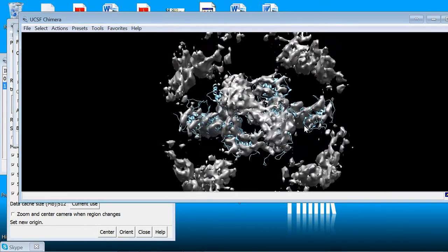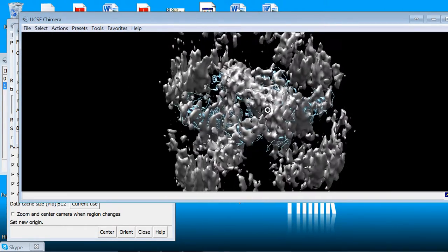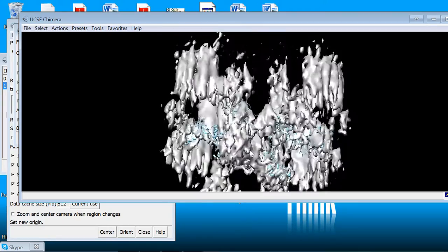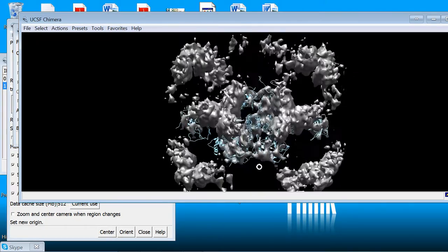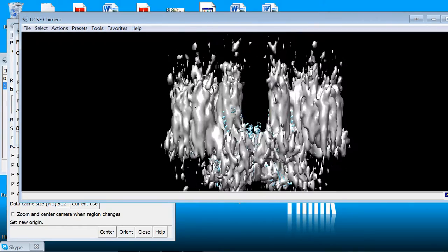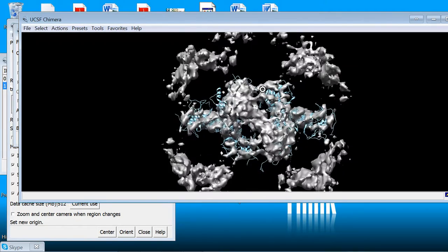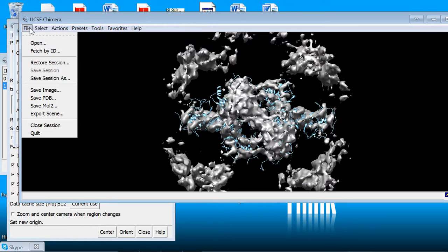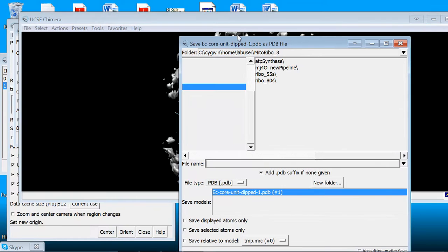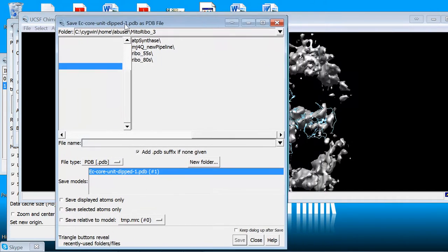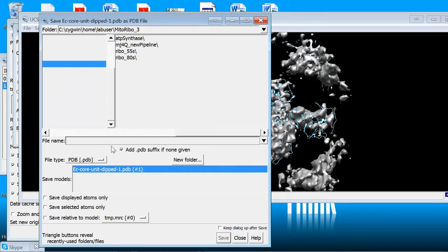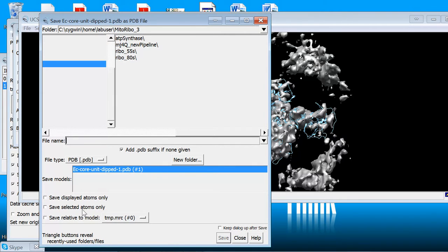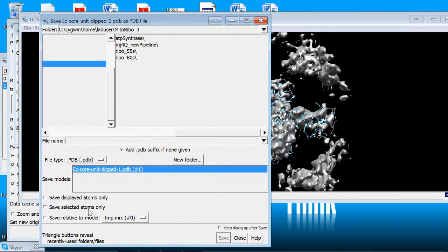But rather than actually trying to go in and transform the PDB, after you examine your fit and you make sure it's okay, at least reasonable to start with, you can go to your file in the main menu and save PDB. Now the important thing here is that if you have multiple models open, just select the one you want to save.